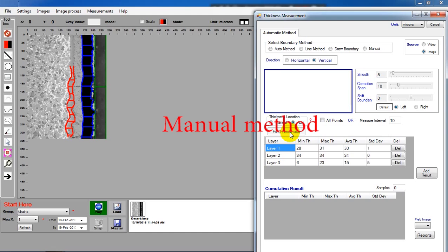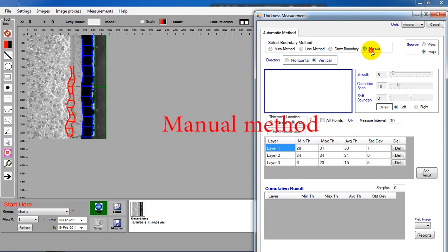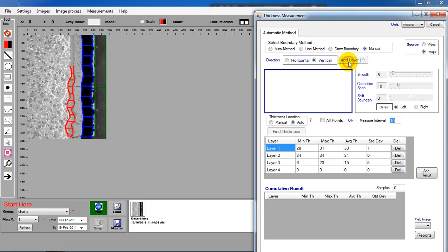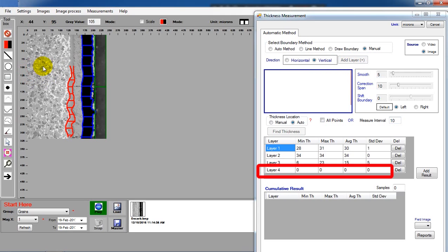Manually method. In this method, use the mouse to draw a line to define the thickness. System will calculate the distance between the two points.